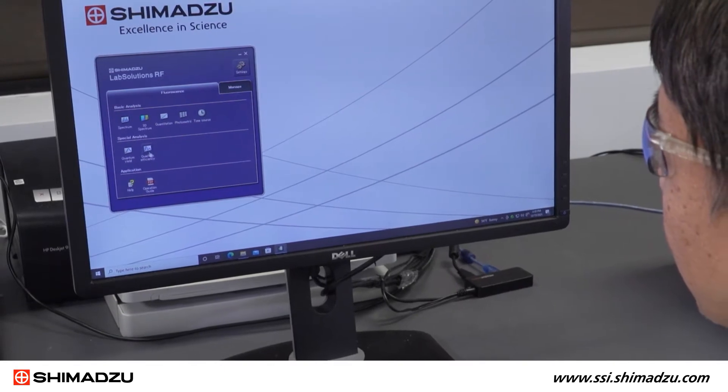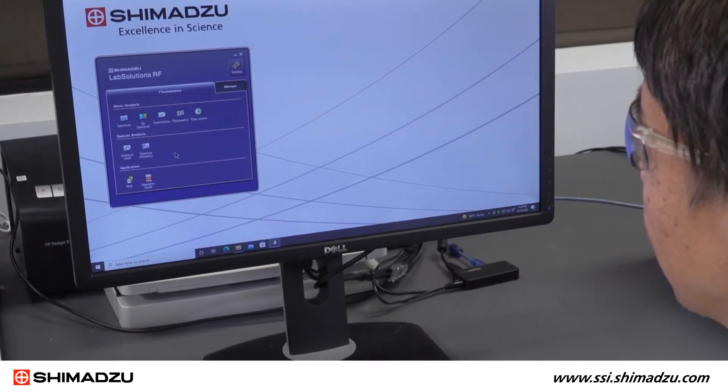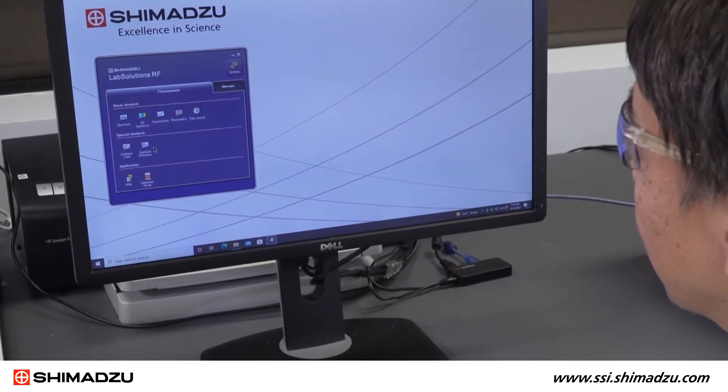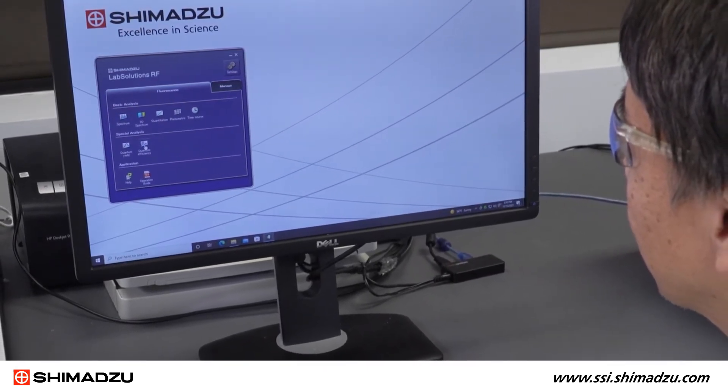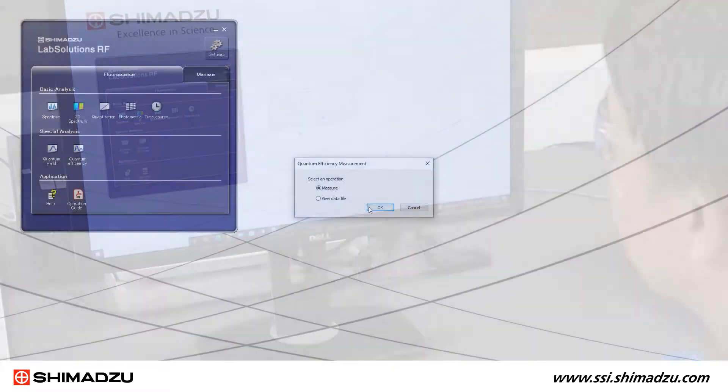Click the Quantum Efficiency button on the blue launch panel to start the quantum efficiency measurement program. Select Measure and click OK to get ready for measurement.